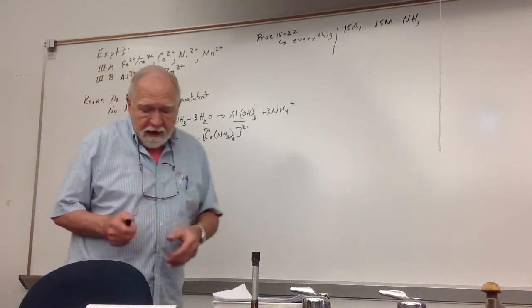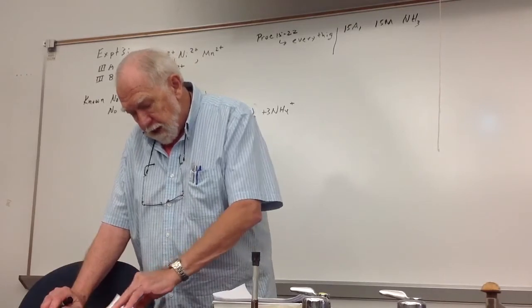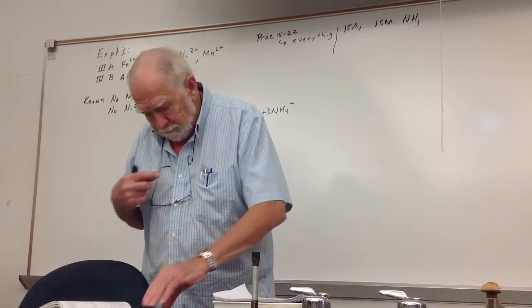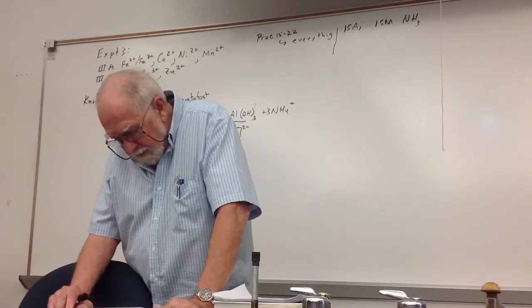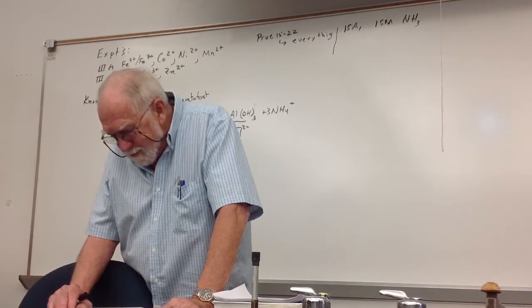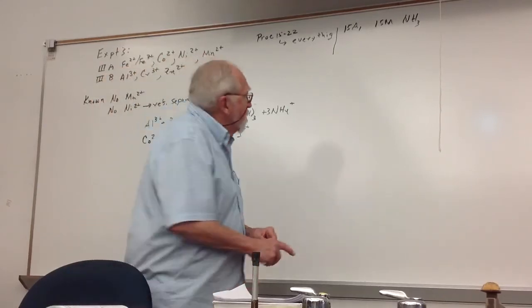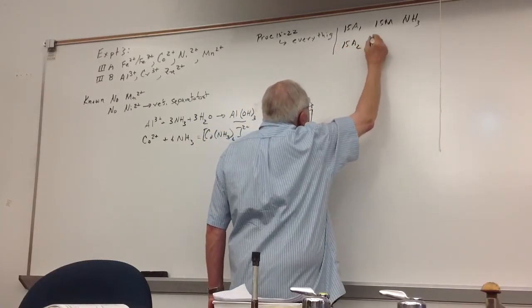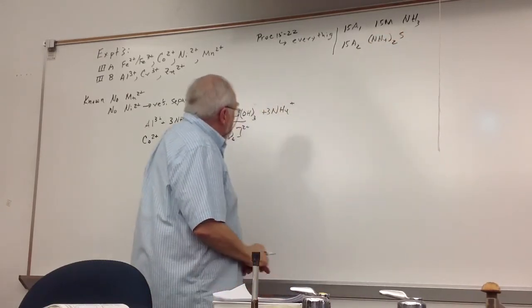Okay, once you finish 15A, you don't take it out of the test tube or anything. You go to 15B. There it is. I'm sorry, not 15B. I want to call it 15A2 because B was just putting it into the casserole. So the next part here is where you're going to add the ammonium sulfide. It says 8 to 9 drops of ammonium sulfide. And this is where the fun starts.